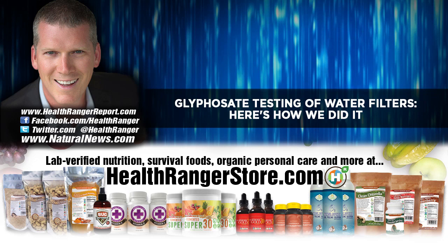Because glyphosate is a chelator. And so if the metal ions are contaminating your column, the glyphosate tends to latch on to those metal ions as well. And if you don't get rid of the ions and the compounds that glyphosate is forming with them, then you're going to have nasty echoes and shadows of glyphosate coming off your column and screwing up your subsequent samples.